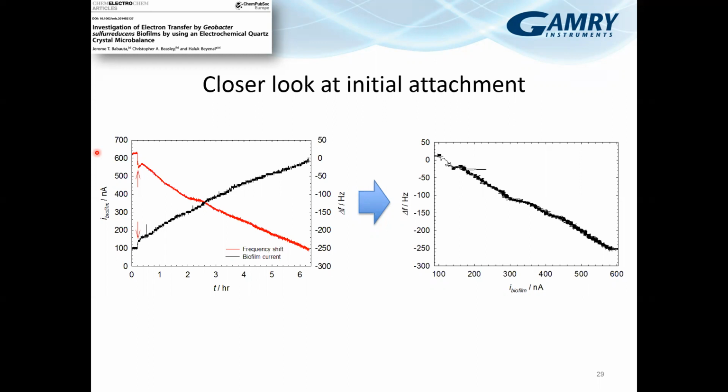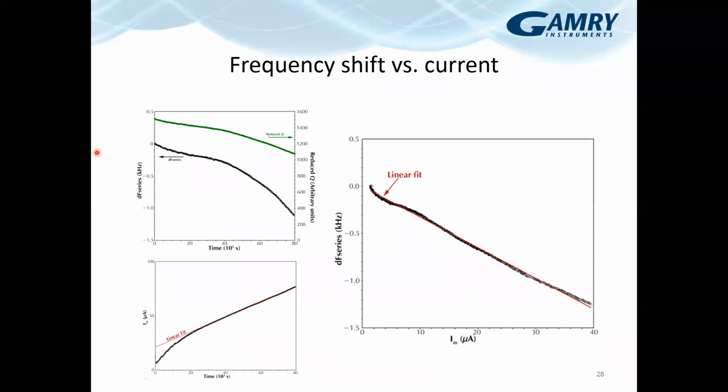Okay, thank you. Jerome, since we're on this slide or somewhere close to here, there was a question. Can you repeat what happens in EQCM when a biofilm becomes less rigid or less elastic?